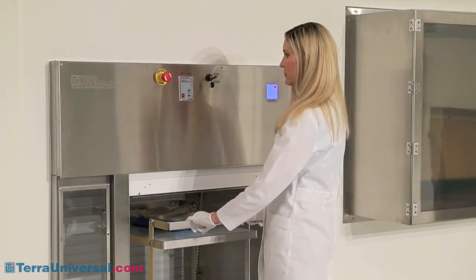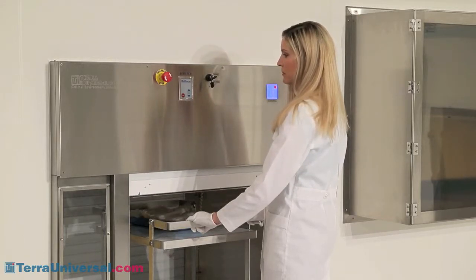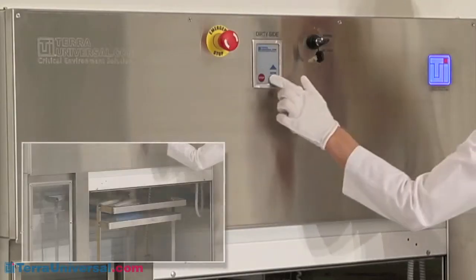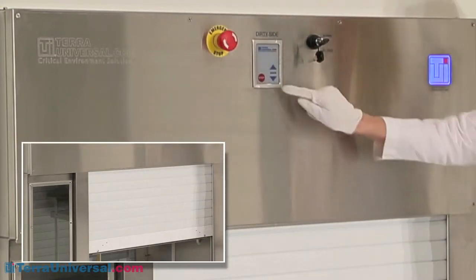These pass-throughs also incorporate a safety feature that immediately halts door motion if an obstruction, such as a cart or operator's hand, interferes with the door motion. An oversized red emergency stop button also stops door motion and puts the system in standby mode.